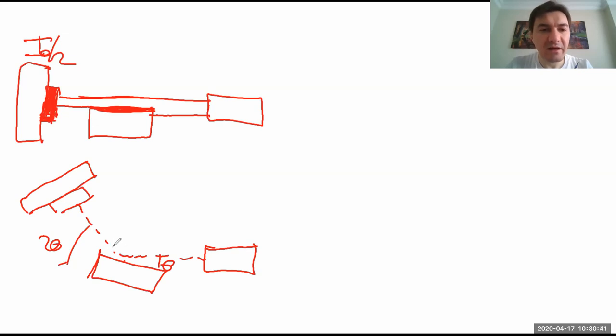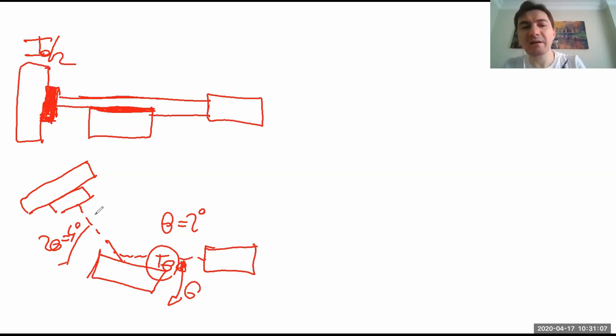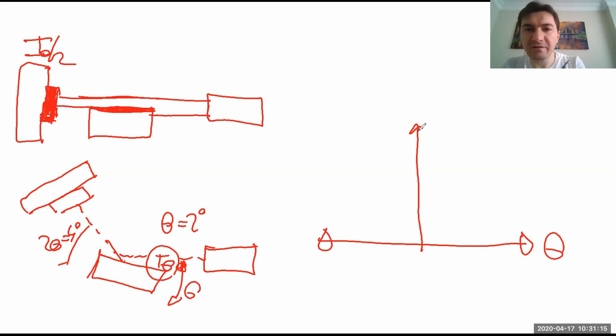So again, here we are repeating the sample scan, theta scan. So let's consider that here theta, this incoming X-ray, the angle between the X-ray beam and sample surface is, let's say, 2 degrees, okay? And 2 theta is 4 degrees. And I am doing a theta scan at that condition. This is the theta. This is the intensity. And this is 2 degrees, okay? Because the detector is staying at 2 degrees.